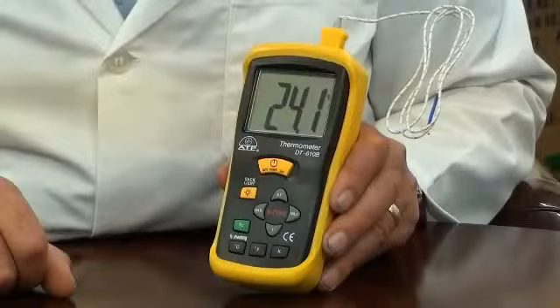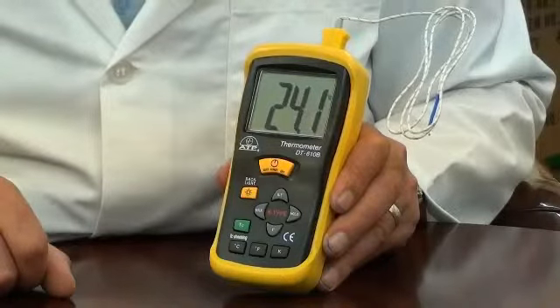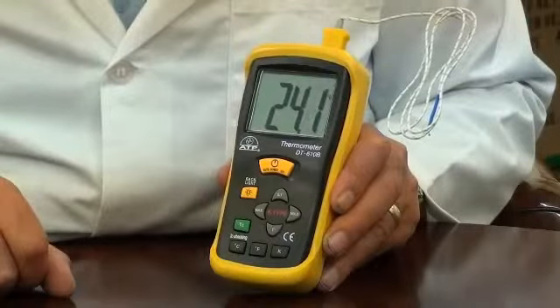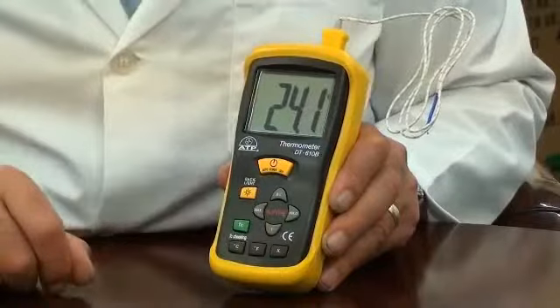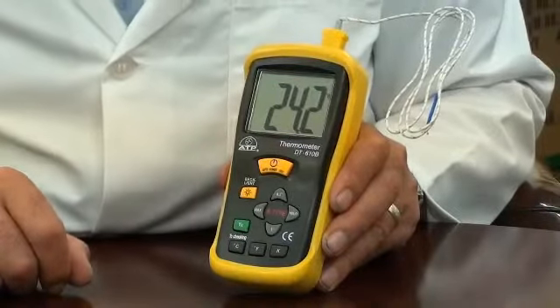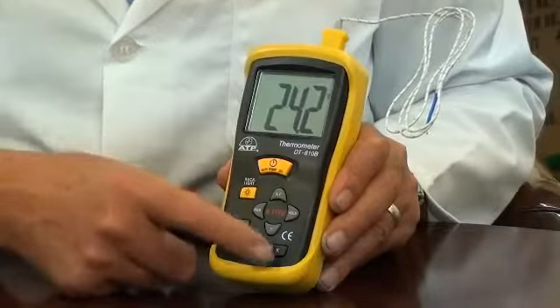It has a measurement range from minus 50 to 1300 degrees C with an overall resolution of 1 degree, but has a selectable resolution of 0.1 or 1 degree for measurements below 200 degrees. The user can also select readings in degrees C, degrees F or Kelvin.